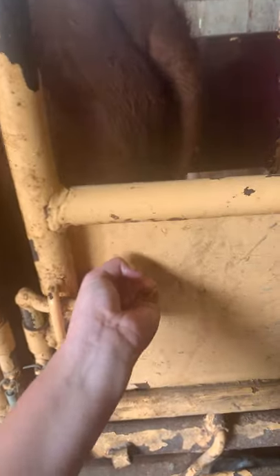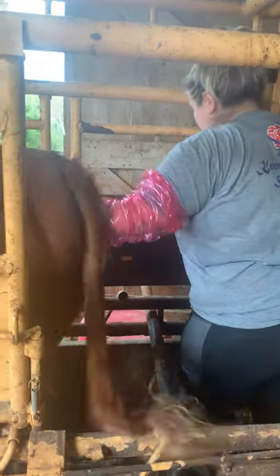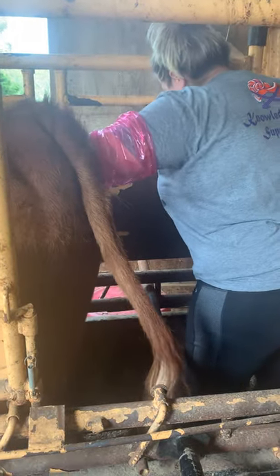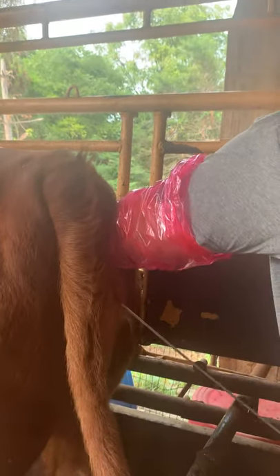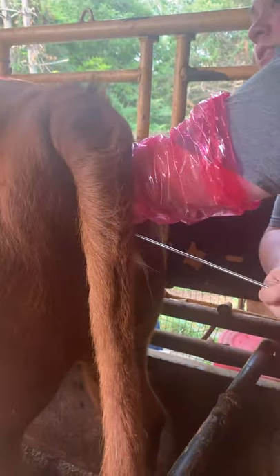I'm going to stick my hand in her rectum — this is a heifer so she's a little bit more tight — and then I'm going to go ahead and find my cervix. I'm going to insert my rod at a 45-degree angle up into the uterus basically through the vulva, and then I will insert the semen. I've got to manipulate the cervix. She's definitely in heat because you can see the goo. Being a heifer, her cervix is a little bit more tight.